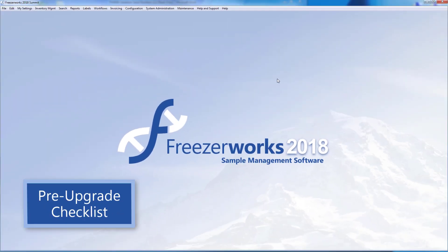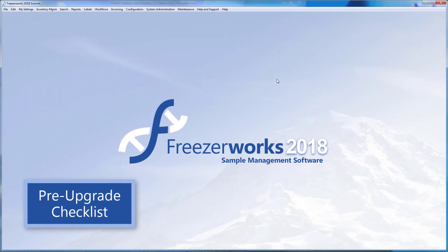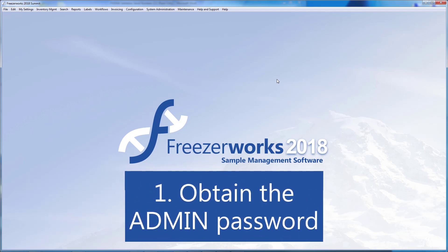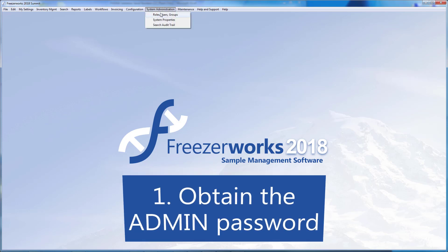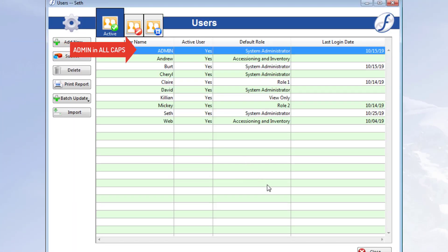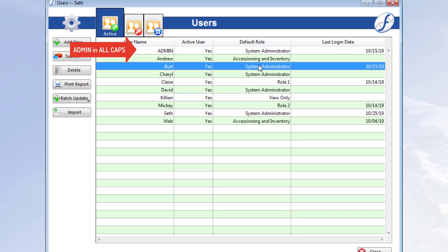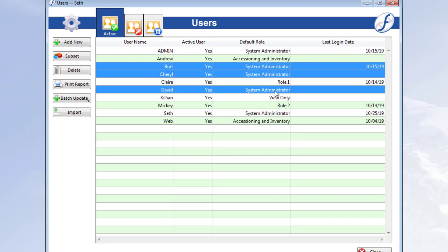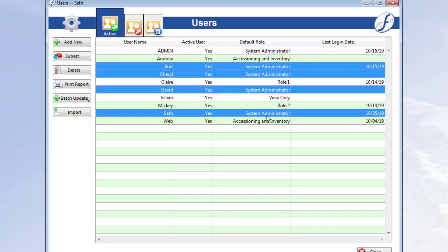Before the actual upgrade, there are five major things you need to do. Number one, obtain the admin user account password, as you'll need to log in as the admin for the upgrade to run. Now this is the super admin user — the one in all caps — not just any user with a system administrator role.